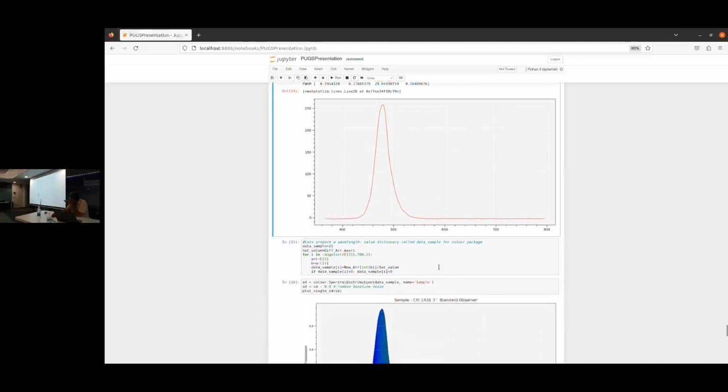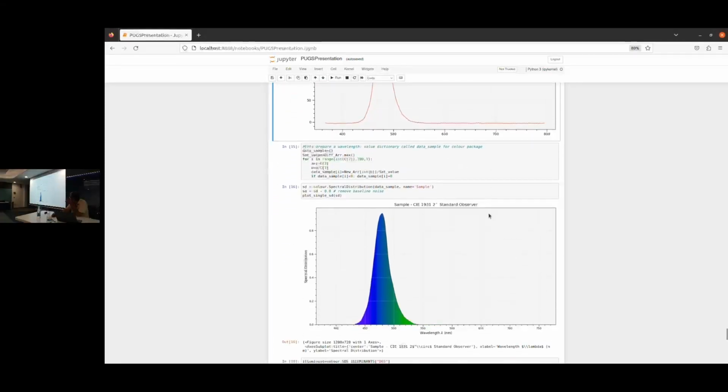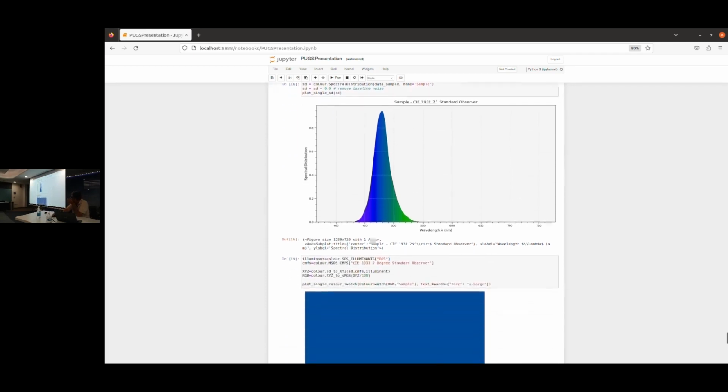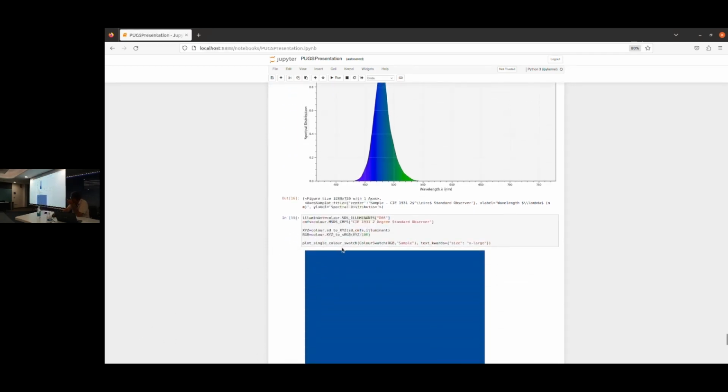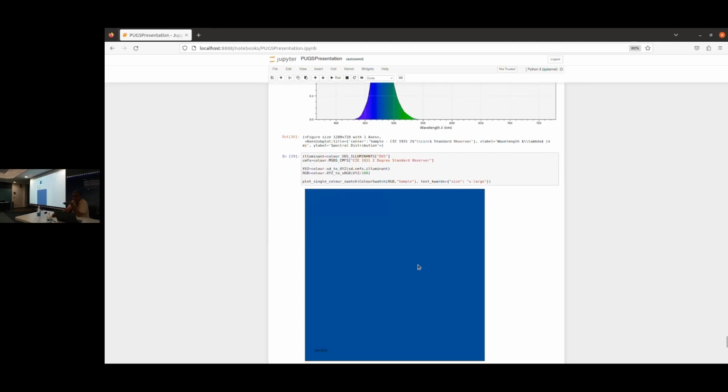So then you're ready to craft your spectral data array. There's some cleaning up you can do. You can plot the array and visualize it. So it shows green over here. This plot basically just paints the spectral colors under the curve. This is not the color of the LED. For the color of the LED, of course, you can use this color swatch function to see how the LED looks, within the sRGB matrix. If it's outside that sRGB gamut, you would have difficulty.